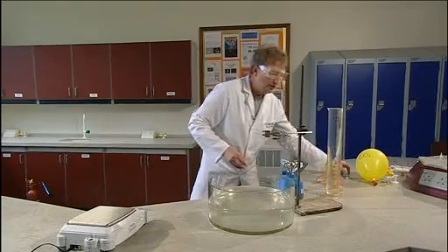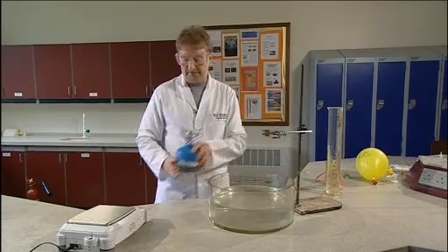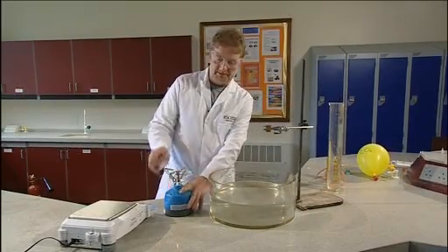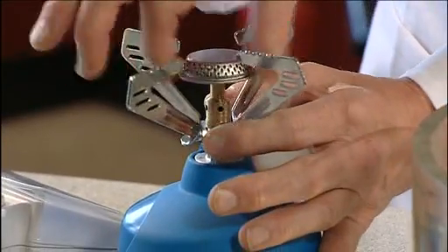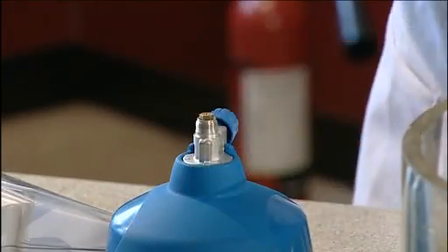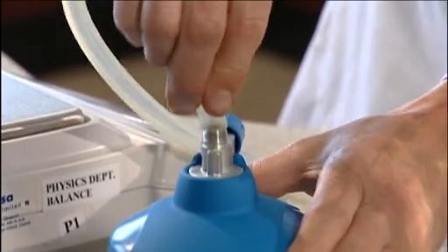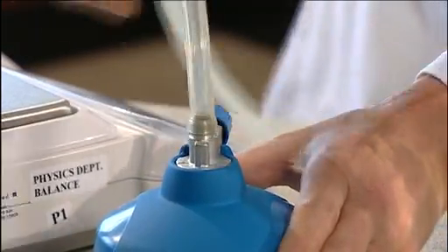What the experiment involves is collecting a cubic decimeter of gas and weighing the container of gas before and after collecting it. If we're using camping gas, the first thing we need to do is remove the burner and the pan holder from the cylinder so that we can attach a piece of flexible rubber tubing onto the screw thread at the top.